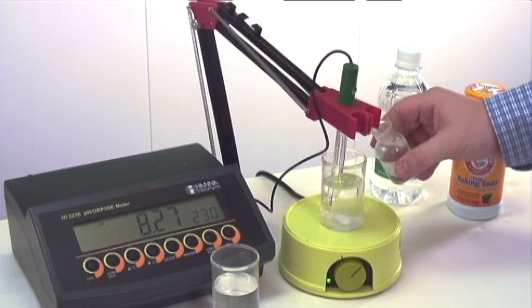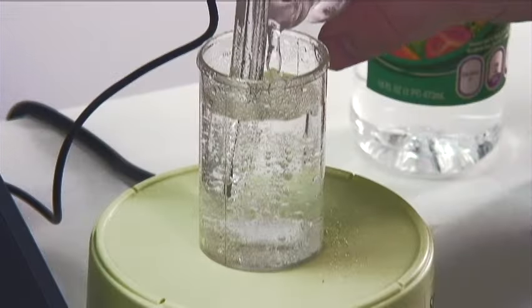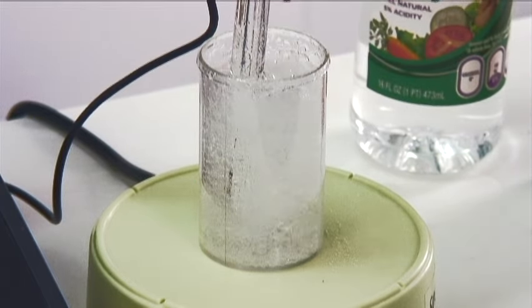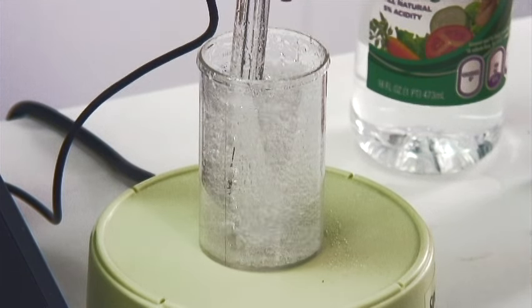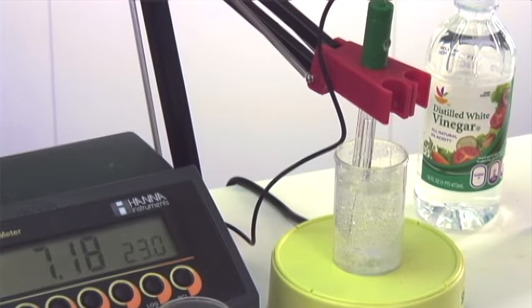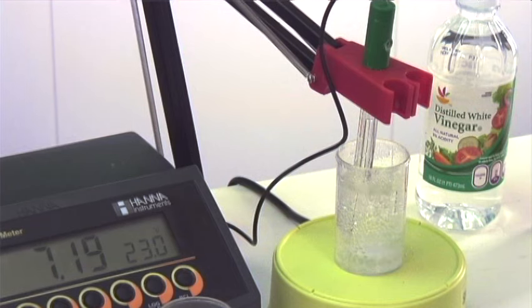pour some of the vinegar directly in. We can see the carbon dioxide fizzing off. We've added a significant amount of vinegar, and there's still only a slight change in pH. It's dropped just over 1 pH unit.